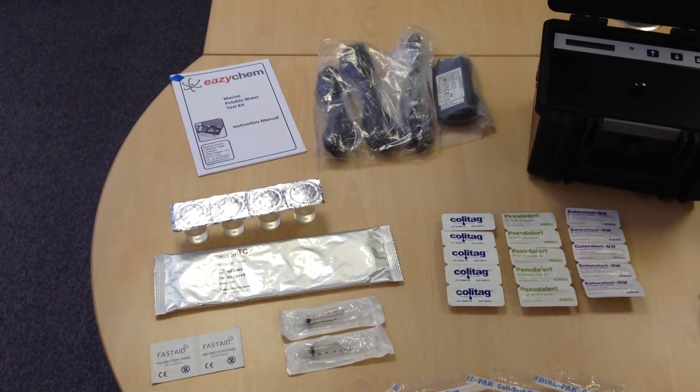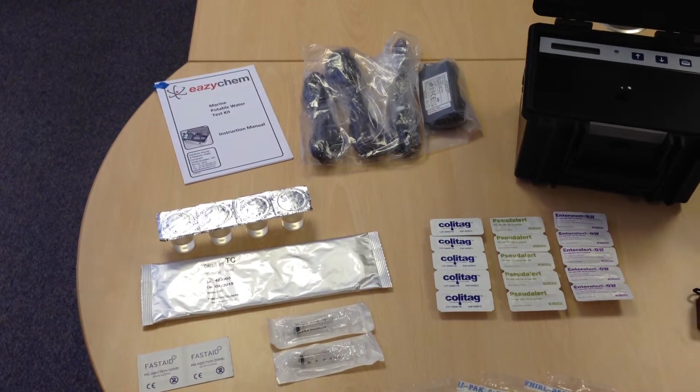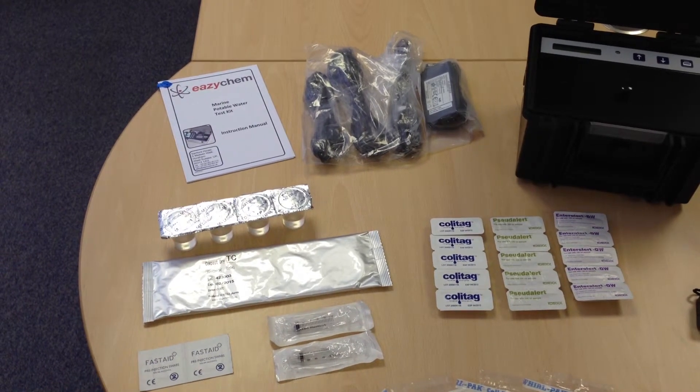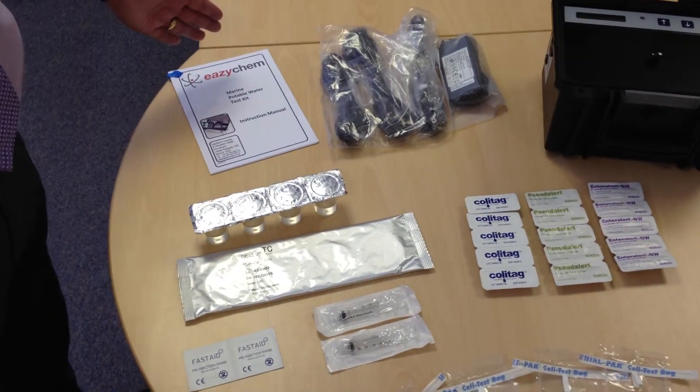Also within the test kit supplied are the microbiological testing components. This includes a variety of tests which are clearly demonstrated within the EasyChem manual supplied with the kit.